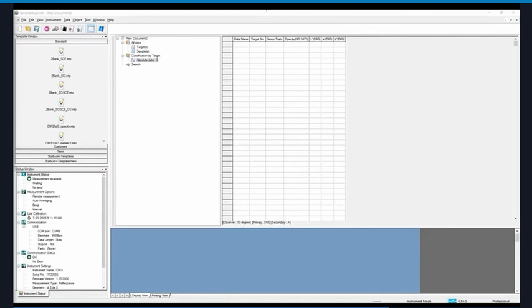Unlike HAZE, opacity measurements do not use a separate measurement of the backing material. While the calculation for opacity does not require separate measurements of the backing material as a reference, I recommend you measure it separately. Having a record of the backing material reflectance will allow you to determine if new lots of the backing material match well, or can help you choose a replacement if the backing in your standard operating procedure can no longer be acquired.